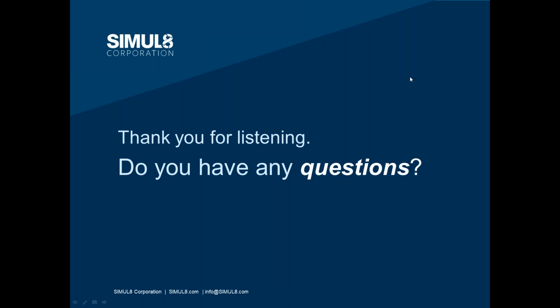Okay, thanks, Tom, and thanks very much to the questioner. We've got another question now, and thanks very much for posting this. It's, can you change the timescale in time and system graphs? They seem to be odd numbers of minutes instead of, say, hours.